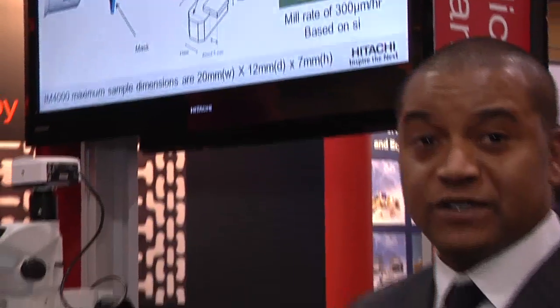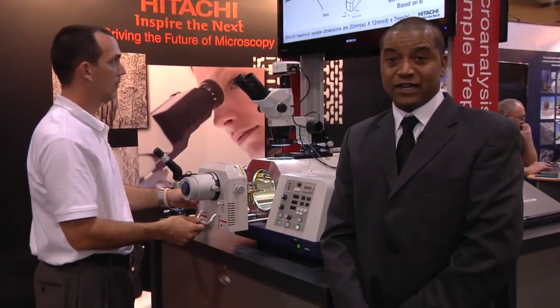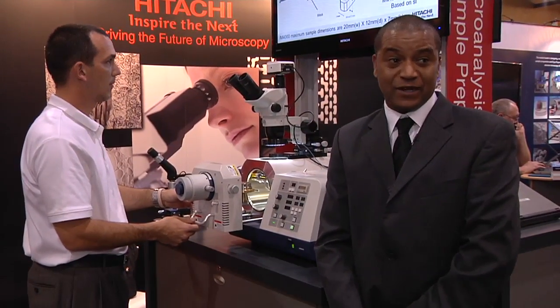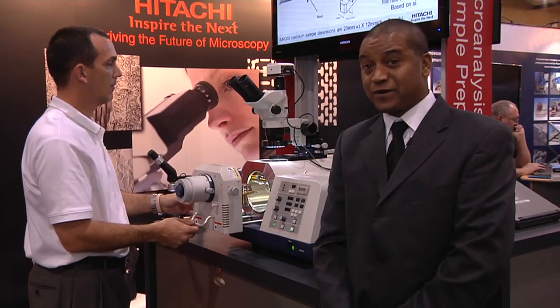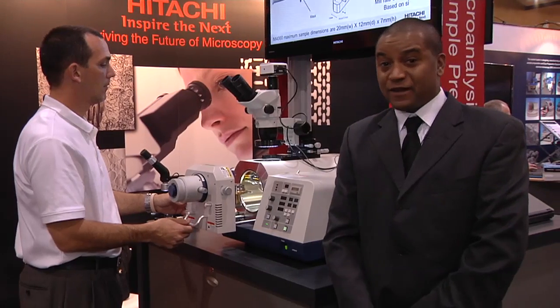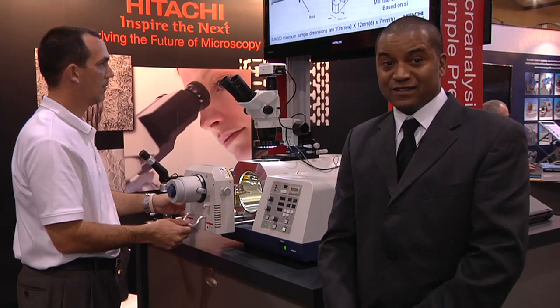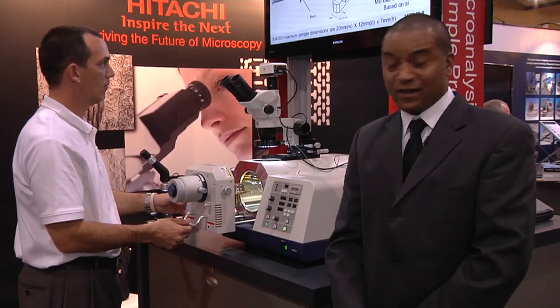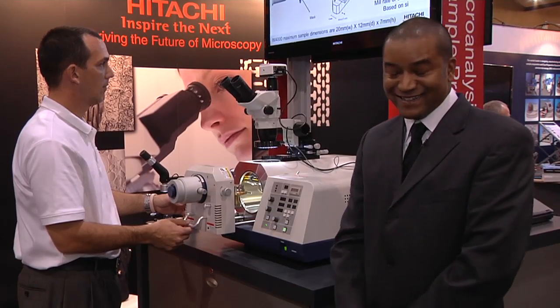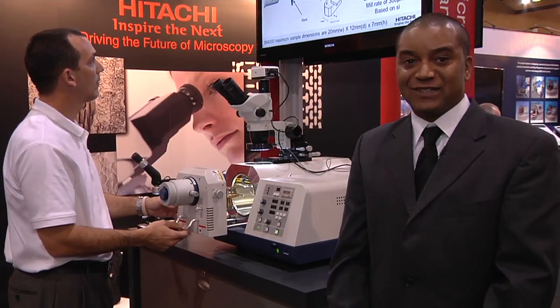Our range is from zero to six kV, and only the Hitachi IM4000 has the highest milling rate available in the market today, which is 300 microns per hour. Other additional options include air protection for samples that tend to be susceptible to oxidization, and we also have low temperature cooling and cryo milling as well.